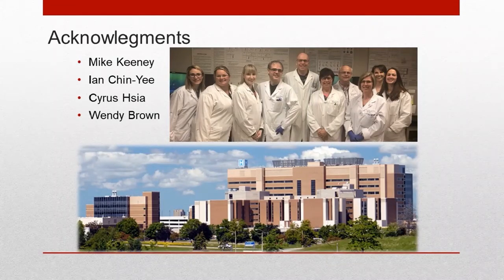And it's a 10-color panel, so it uses all the detectors on the instruments that we have. There's no reason why you couldn't run other 10-color panels with those same settings.